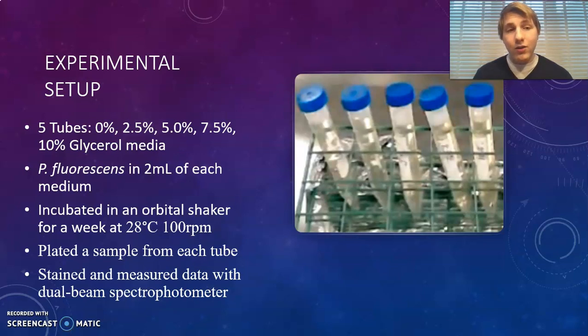in order to qualitatively analyze their colony morphological differences. So also, I stained and measured data with a dual beam spectrophotometer in order to be able to obtain quantitative data as to the effects of glycerol on biofilm production.